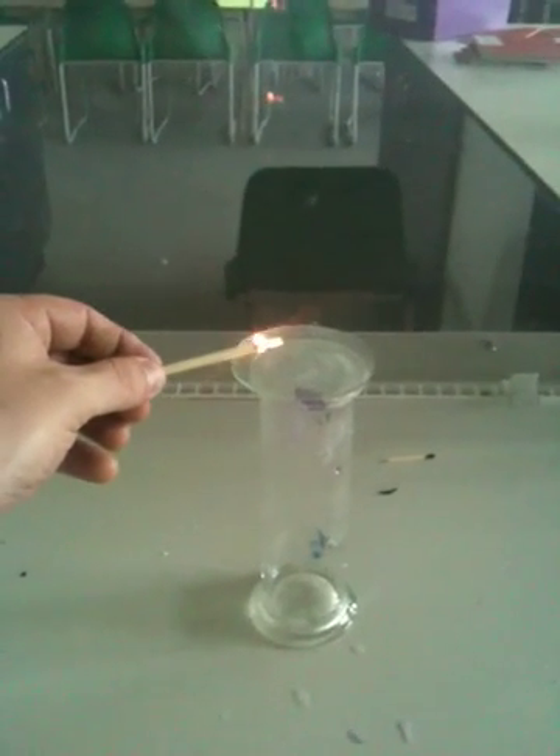Any change in the litmus paper? Can't see any color change — the chlorine has bleached it, but the room air has done nothing. So if we light the splint, we're going to film it from here so we can see.